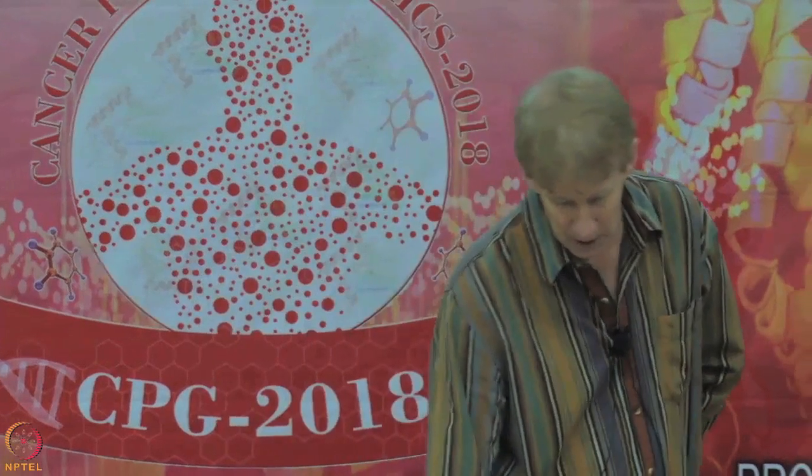Here are some of the features. It takes a lot more time to do an experiment this way, a lot more instrument time. There is some loss of accuracy in the quantitation due to compression that I'll talk to you about. The reagents can be expensive. Here you have less potential for plexing, and in order to get a heavy label, you have to add that to the cell culture that is going on. That means you can't label humans. This is really suited to working with cells in cell culture.